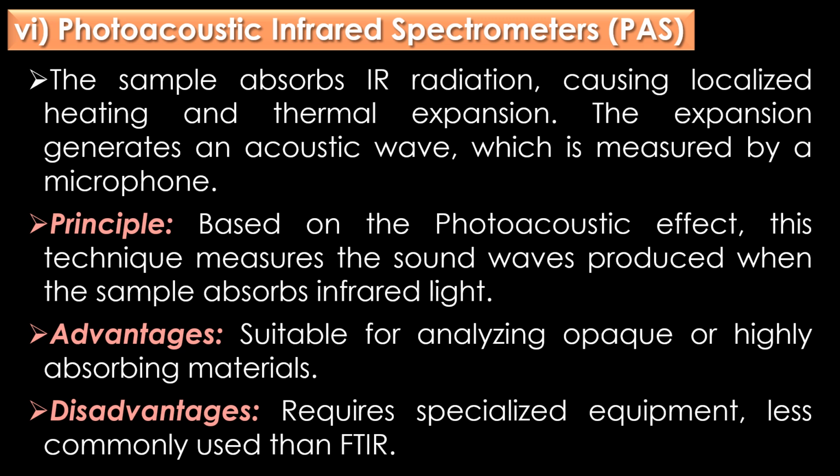Advantages: this technique is suitable for analyzing opaque or highly absorbing materials. Limitations or disadvantages: this technique requires specialized equipment and is less commonly used than the FTIR technique.